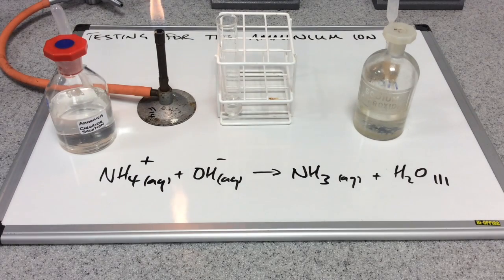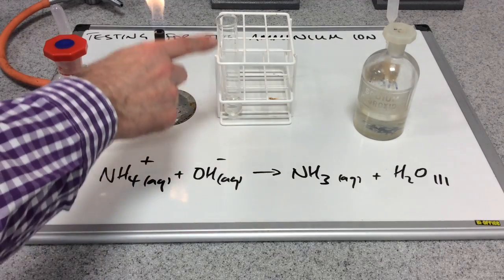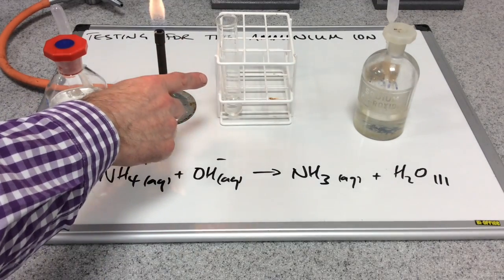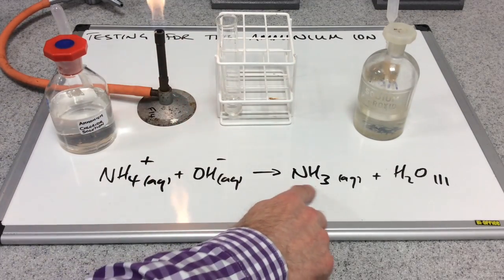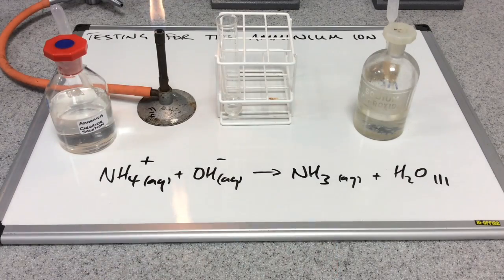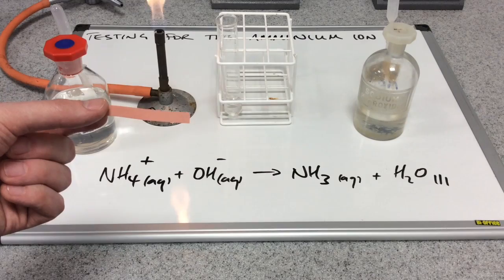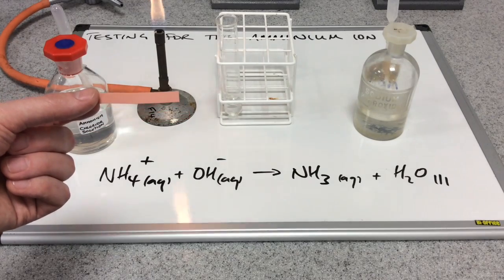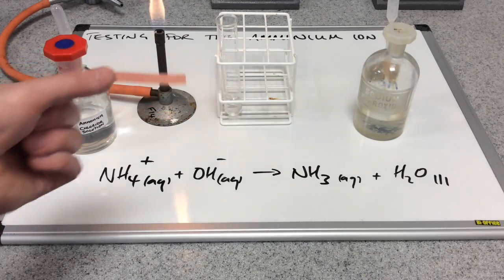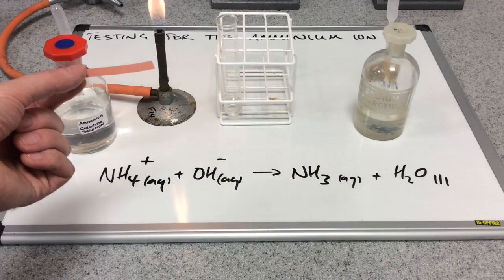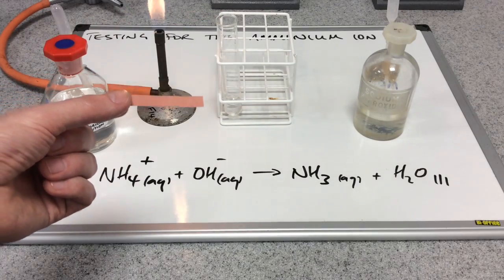You can see I've lit a Bunsen burner now, and that's because the next part of the test requires a source of heat. What I'm going to do is warm this test tube gently to turn the ammonia into a gas, and then I'm going to use this indicator paper. This is red litmus paper, but you could use universal indicator paper. I'm going to hold this in the mouth of the test tube and test the gas that comes off.